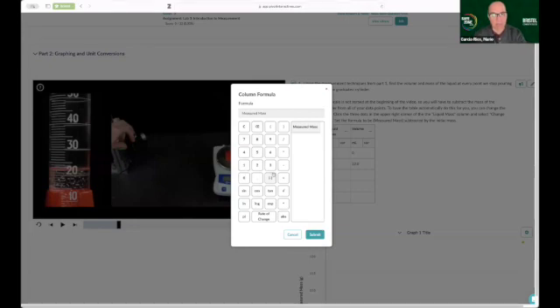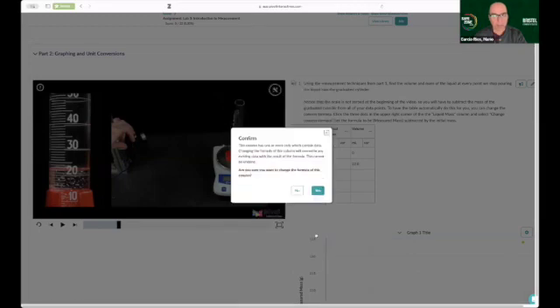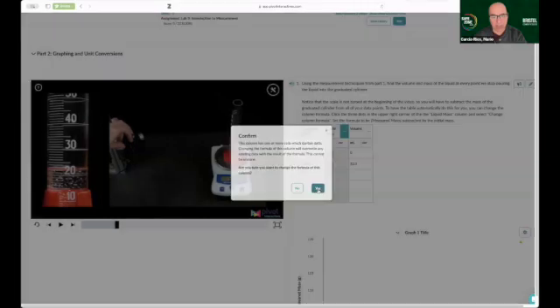And then I'm just simply going to hit the minus sign, and then the 96.4 grams of the graduated cylinder. Oops, I need to put a period. 96.4. And I'm going to submit that. So when I do that, I get a warning. Read what the warning says, and just go ahead and accept it.